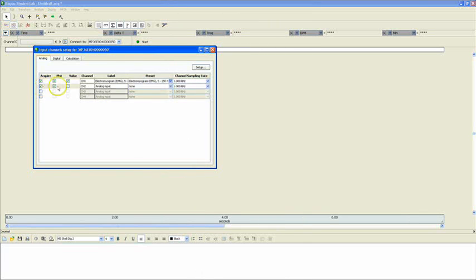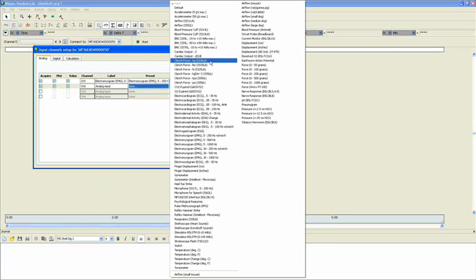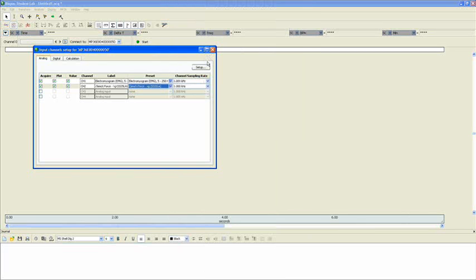Next, we can select these three buttons again, and go back to the Preset drop-down, and select Clench Force. You'll see that we have options for kilogram, pounds, and newtons. We'll select kilograms. Now, we've got both of our analog channels set up, and we can go over to the Calculation tab.